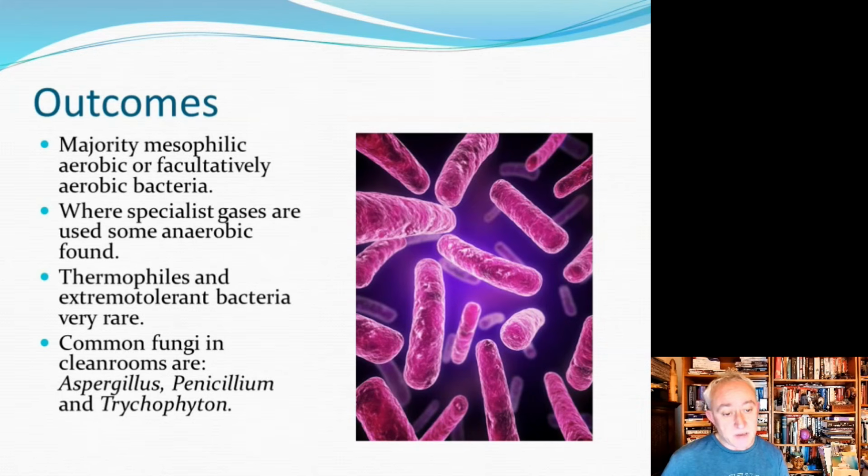And we tend to find very few organisms that you would regard as extremotolerant. In terms of fungi, where fungi are recovered, Aspergillus and Penicillium are the highest, sometimes Cladosporium. Sometimes in changing rooms we may well recover Trichophyton, which is the organism associated with athlete's foot.